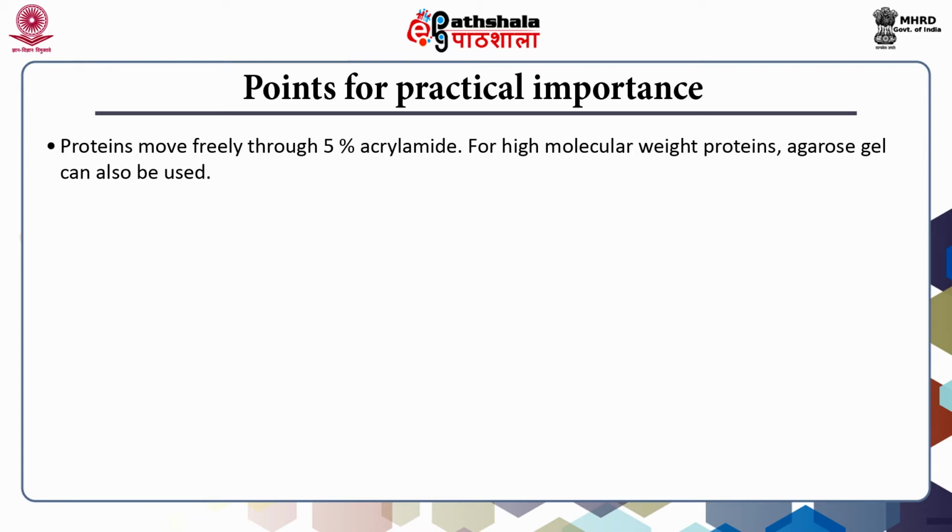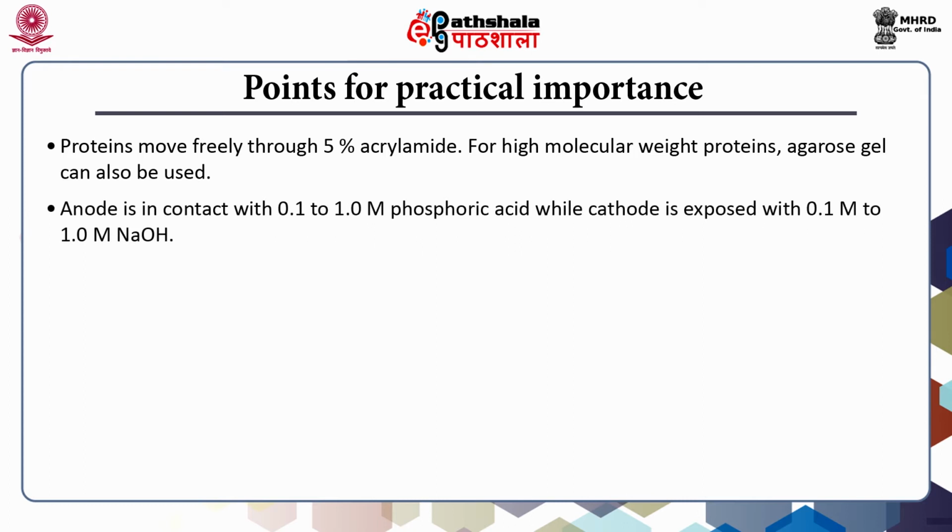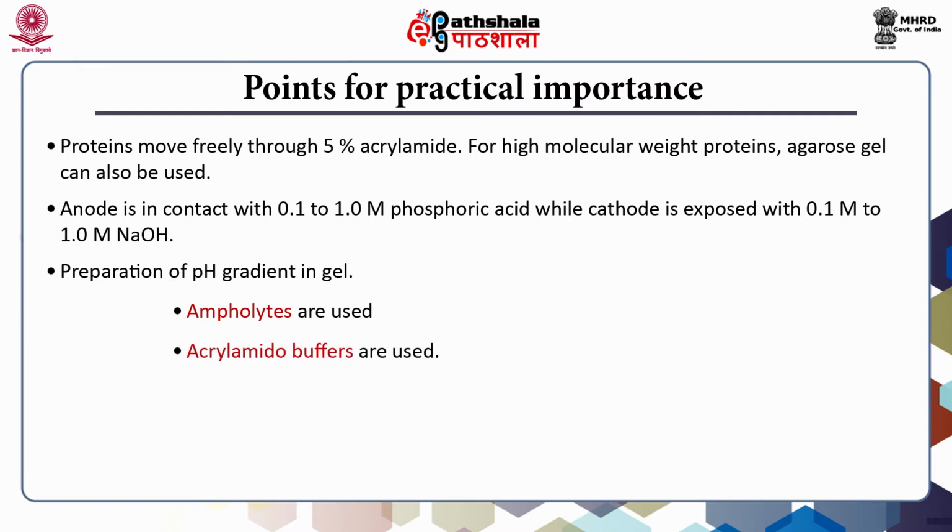For high molecular weight proteins, agarose gel can also be used. Linear pH gradient is prepared in support. There are two approaches which are used for preparation of pH gradient in gel. In first approach, ampholytes are used, while in other approach, acrylamido buffers are used.